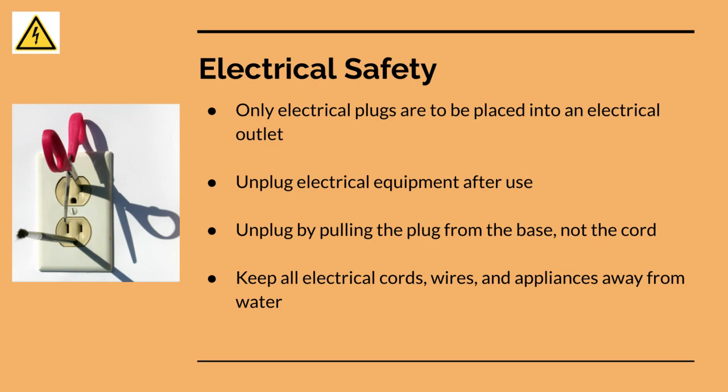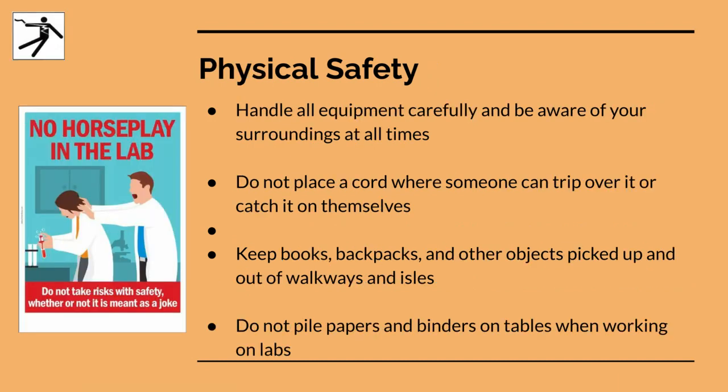So there's no risk of any kind of electrocution. You're safe here. I can't speak to when you're at home. If you're doing something at home, use the best practices that you should already be doing. Be super aware and careful of where the water is in relationship to your electrical outlets, cords, wires, anything like that. Okay, easy peasy.